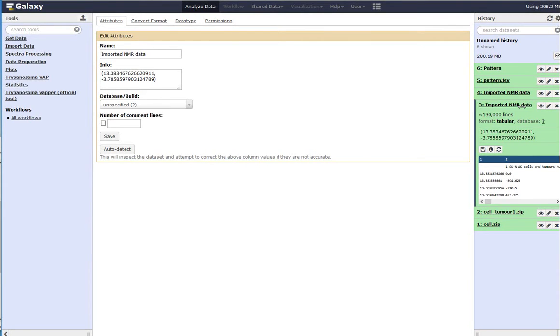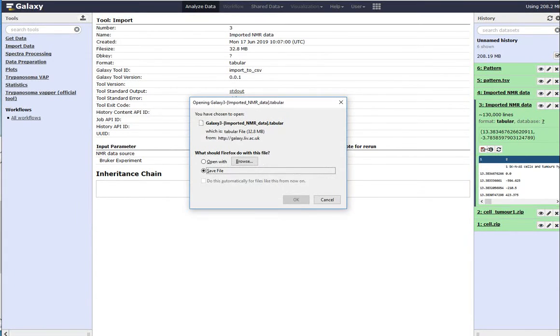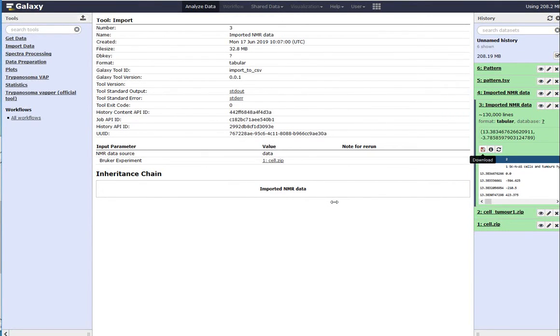If you are unsure where this data has come from, selecting the title on the right-hand browser will enable you to look at the information icon. Here you can see some information as to the date and the time as to when it was collected, as well as what the actual title of the data that was used to create this object. We likewise could save the data as an external download at any time, and this is very useful when porting data processed in tameNMR into other software.